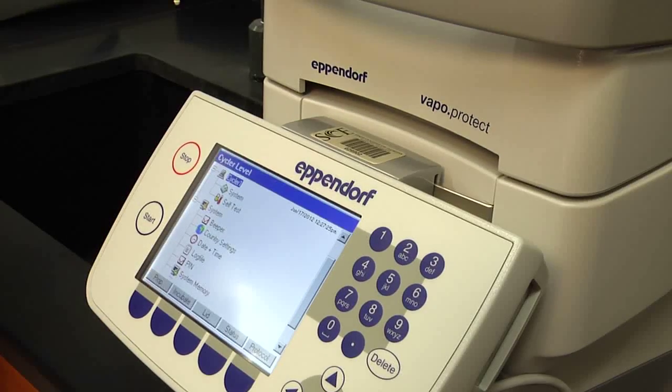One of the real changes in biology in the last 20 years is the development of polymerase chain reaction. This technique, also called PCR, has revolutionized how biology is done. The students are going to have a chance to use this instrument in many different ways.